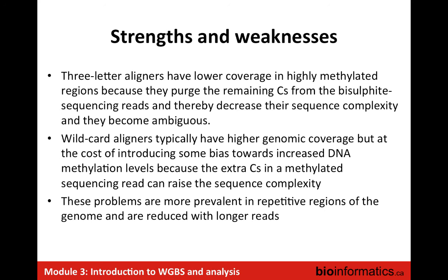Wildcard aligners typically have higher coverage overall, so they keep more of the reads, but they do have this bias in some cases that was illustrated in the previous slides. So these problems, if you look at normal regions of the genome, are actually not a big deal, such that both approaches end up being quite comparable.